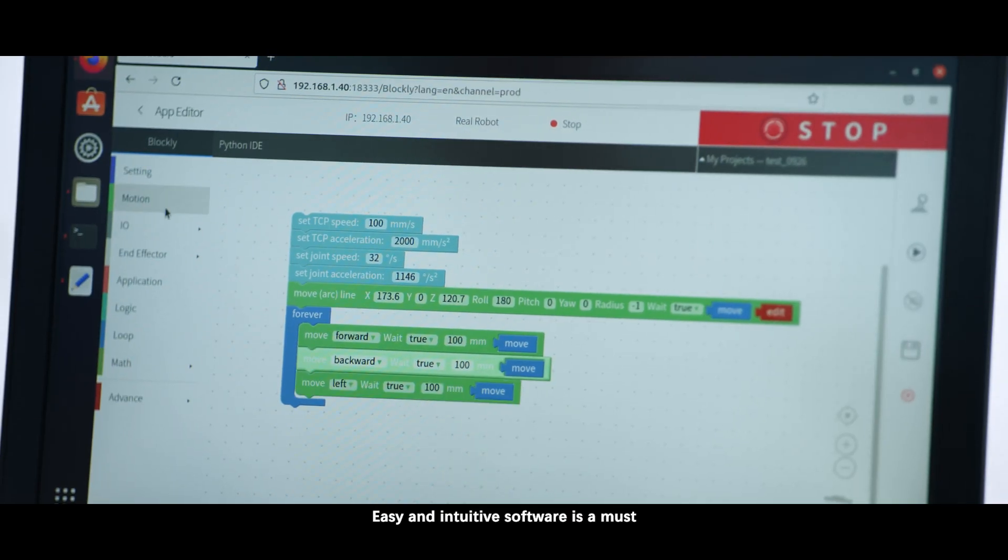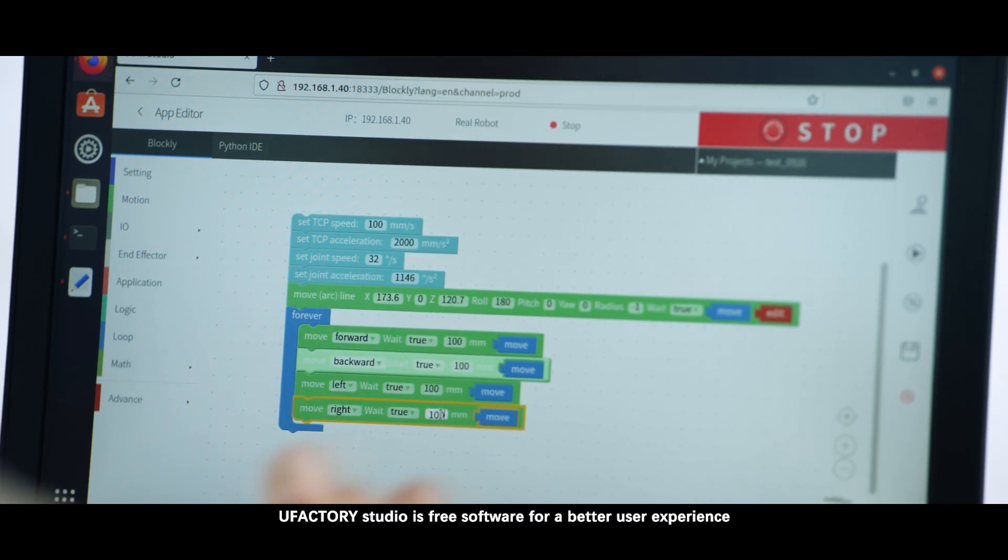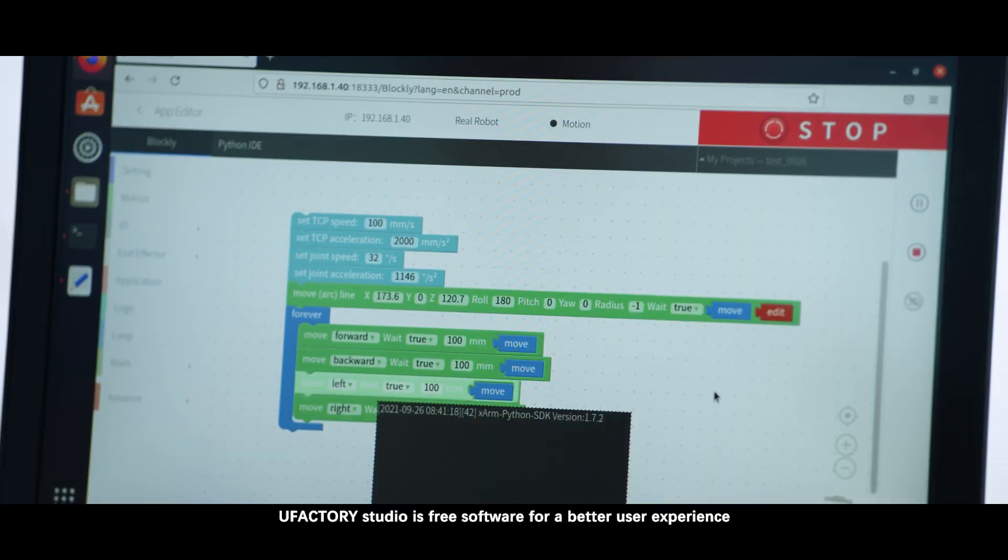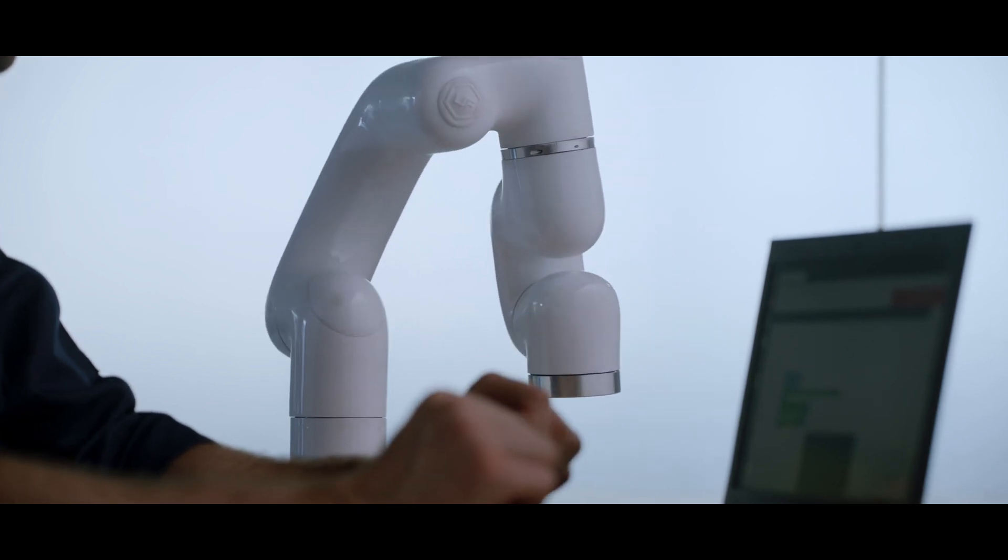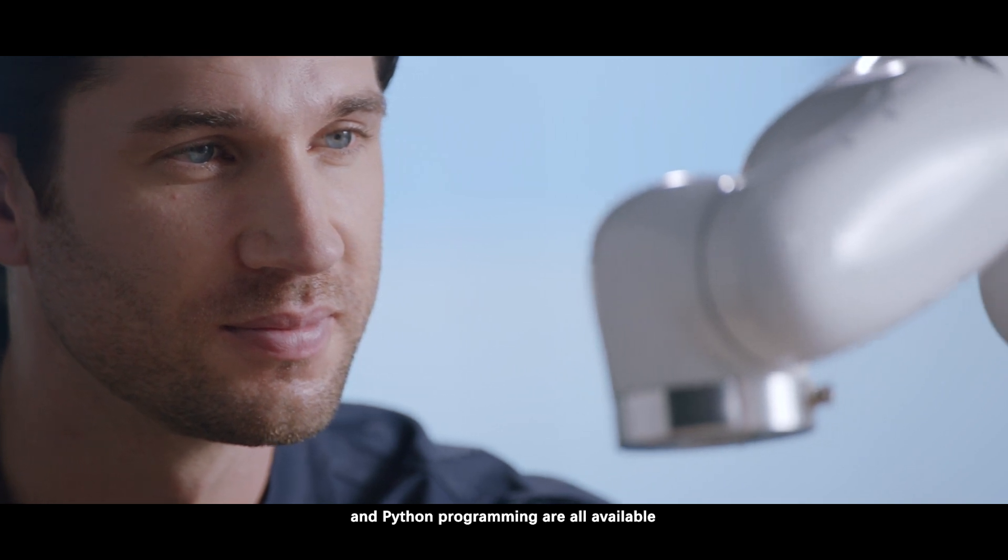Easy and intuitive software is a must. U-Factory Studio is free software for a better user experience. Control Panel, Recording Mode, and Python programming are all available.